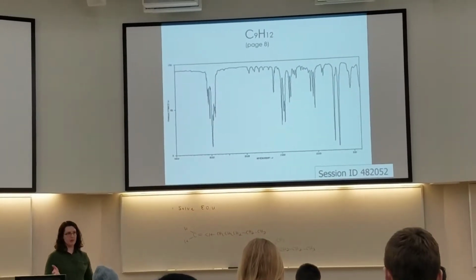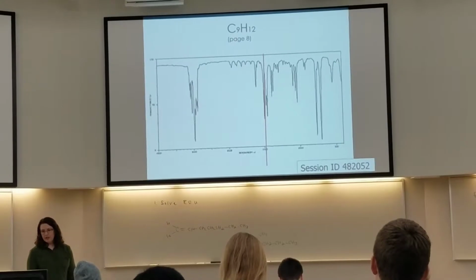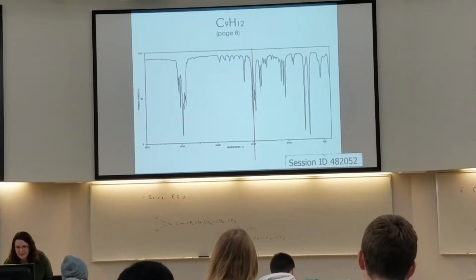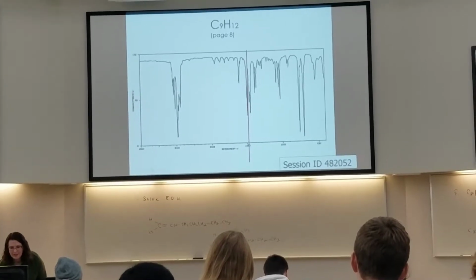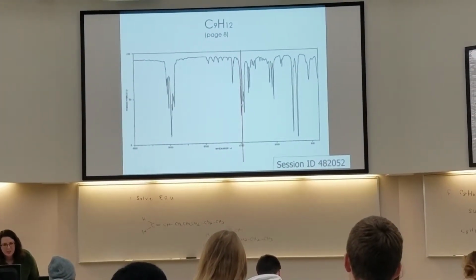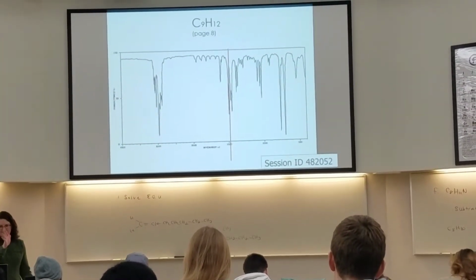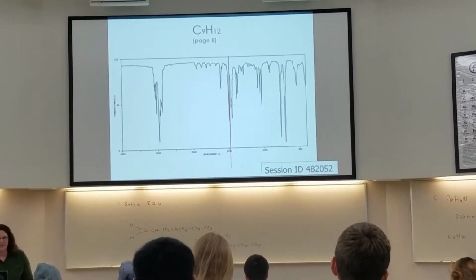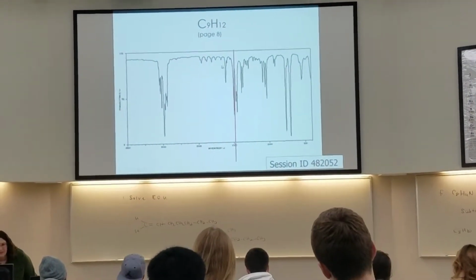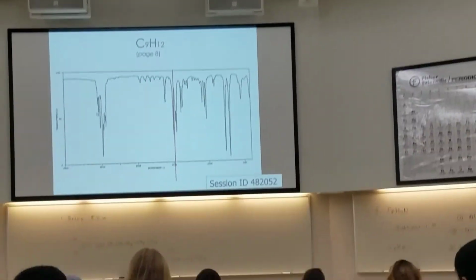So start the same pattern though. Find 1500, draw a line. And then what happened, my line is just a little bit off. You can see on my screen. So this peak is maybe not something that we're looking at. My line should be just over just a little bit. So we've got this peak that is kind of like the first one, and then there's some stuff through the middle, and then this shoot over here at the end.